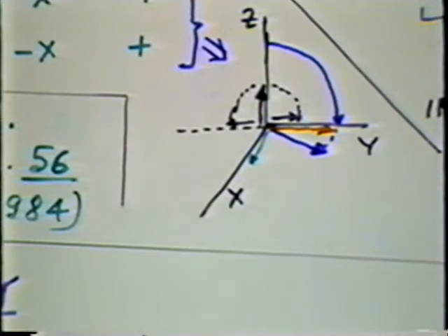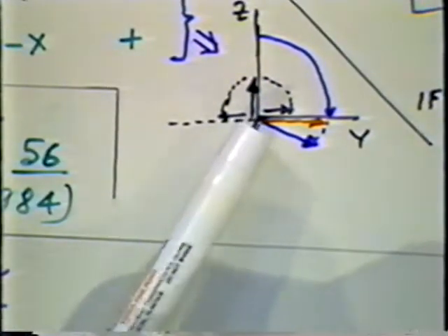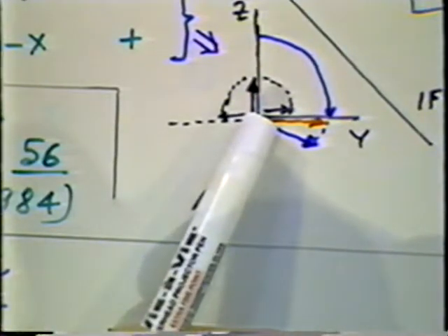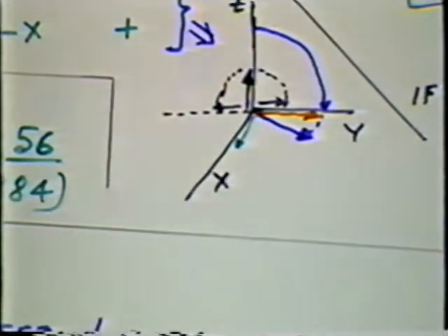And therefore, you see, by doing the second pulse along the x-axis, I was going to throw away the red part and keep the green. And it doesn't matter whether I do plus x or minus x for the green. But for the black part, which is along the z-axis, it changes sign. And so simply you can remove the axial peak in such a manner.